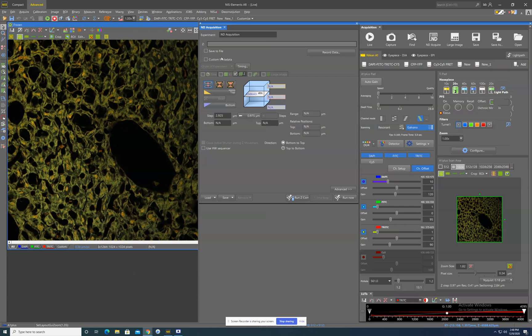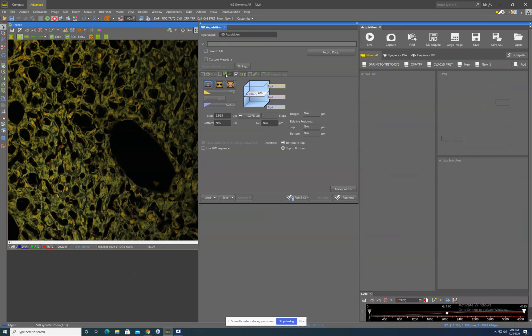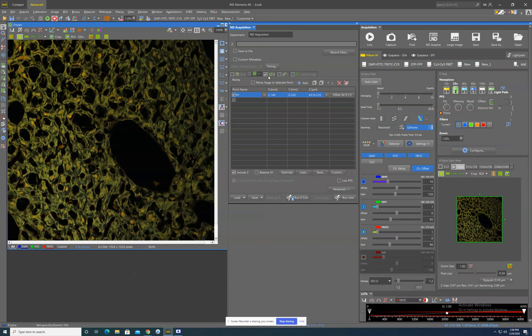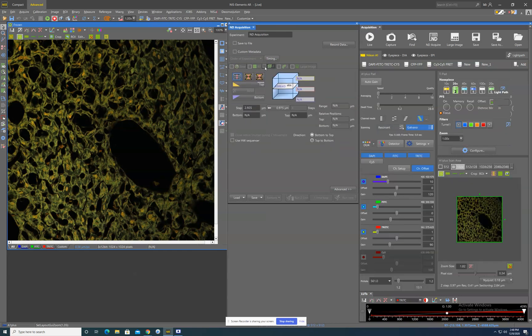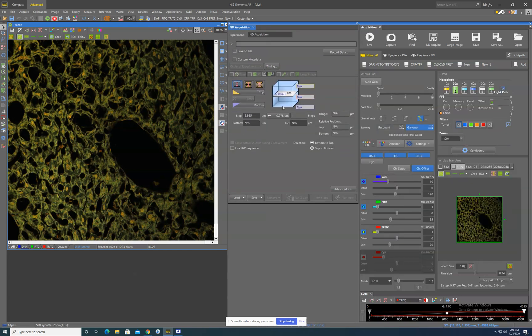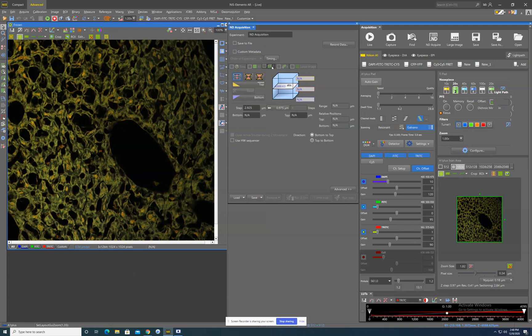Today we're going to go over just really simply how to set up the ZStack. The ZStack option is in the ND acquisition tab. It is this third tab over. As always with any of these tabs, if it is checked, then the system will perform this action when you hit run now. If it is unchecked, it will not perform this action.